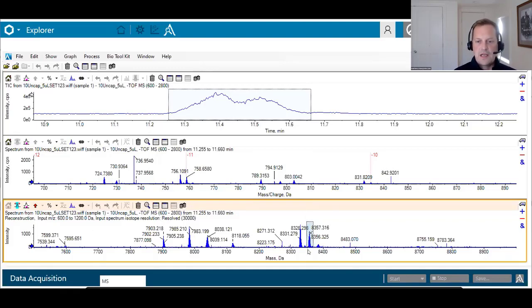Sometimes in deconvolution, you can get artifacts or harmonics, and this is just a nice way to confirm that I have a nice repeated charge state profile here, and I am not, for example, using charge state series that are not represented in the raw data. So, again, that's a nice little feature within the software that I like to use as a QC check. In this assay, we should know what the targets are, so I've already copied down these different components.